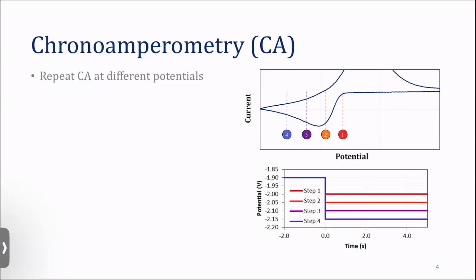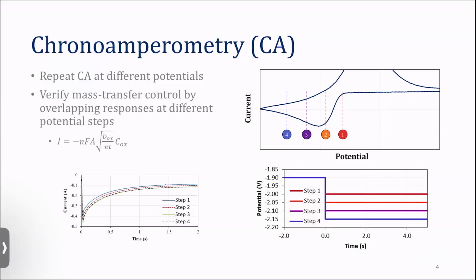So at step 1, we're near the equilibrium. Step 2, we've now increased the potential where there's an appreciable amount of the reaction occurring. And steps 3 and 4, we're even further along. And so let's see what happens as we take steps to those 4 different places. So for step 1, you can see that we have this blue curve here on the left bottom plot. Step 2, it becomes even more negative, and then steps 3 and 4, they practically overlap.